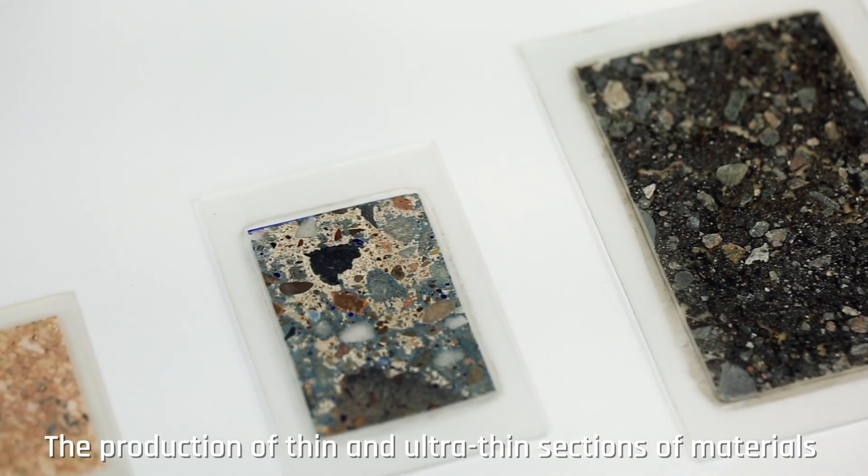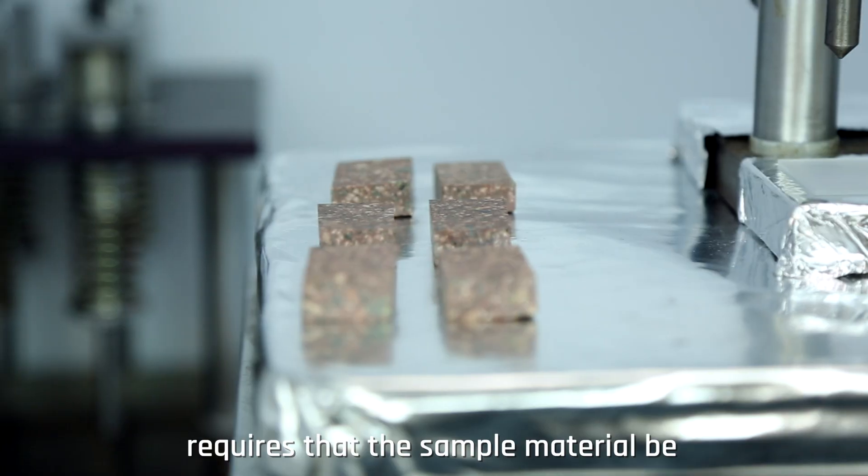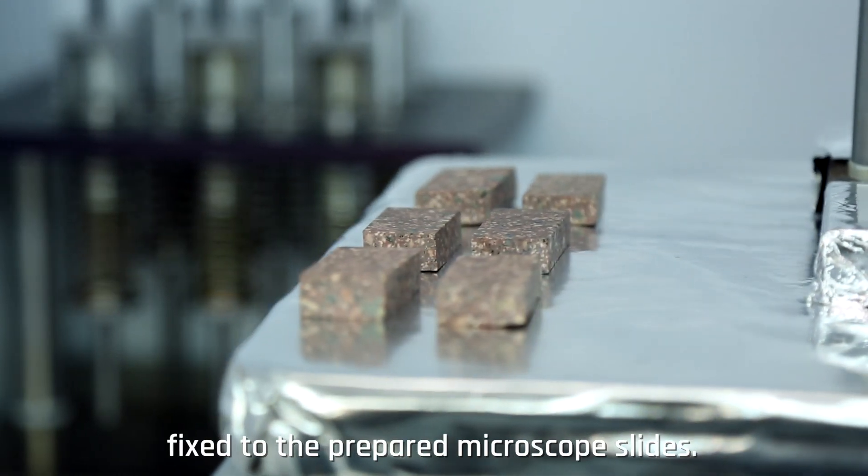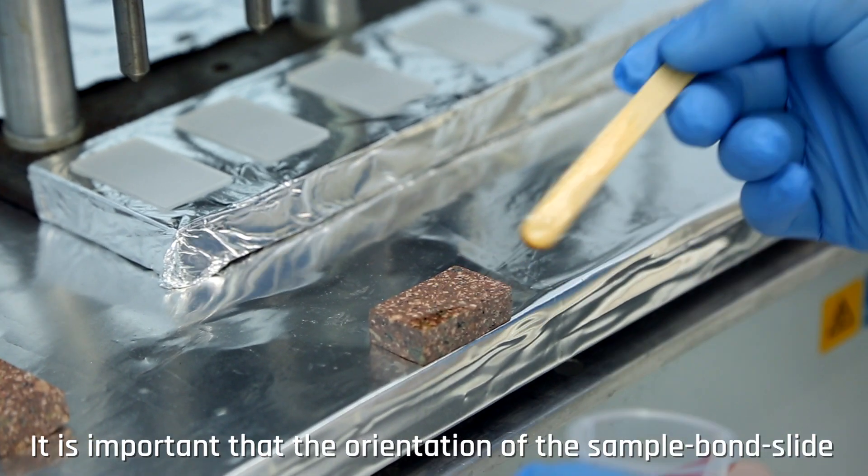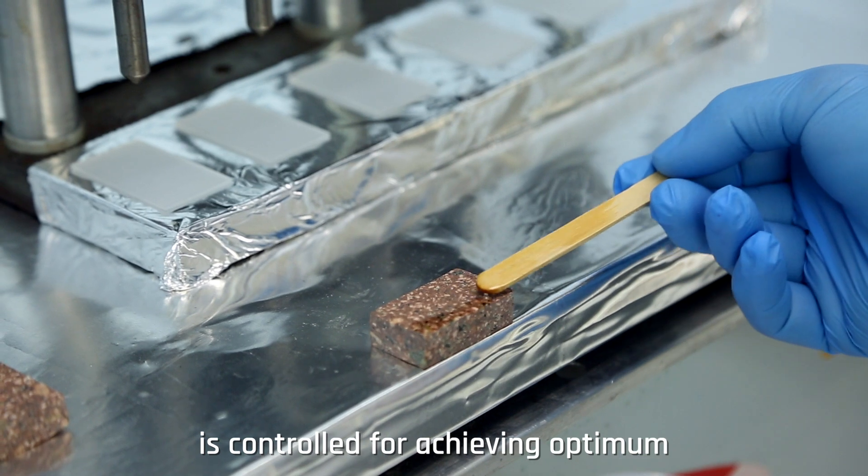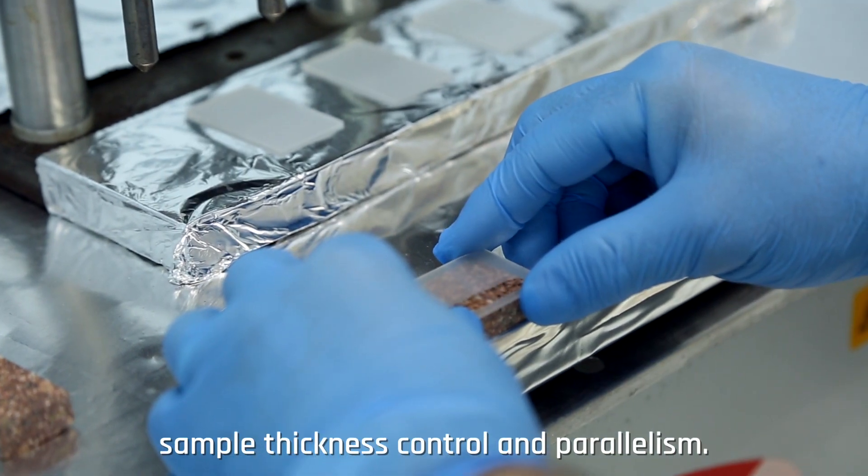The production of thin and ultra-thin sections of materials requires that the sample material be fixed to the prepared microscope slides. It is important that the orientation of the sample bond slide is controlled for achieving optimum sample thickness control and parallelism.